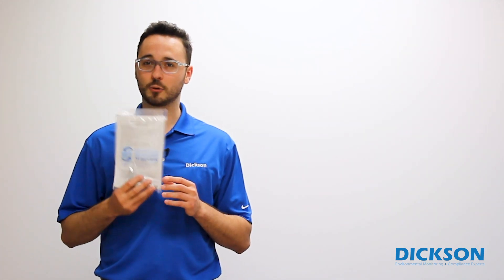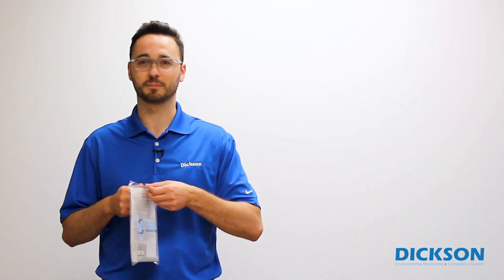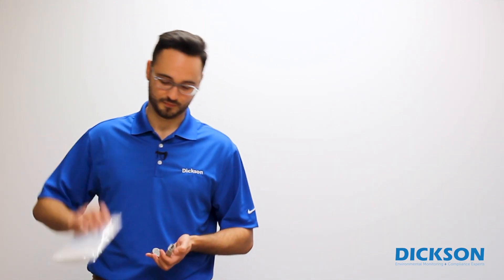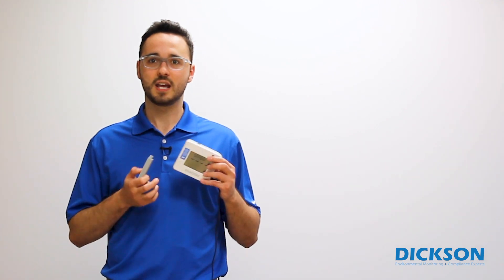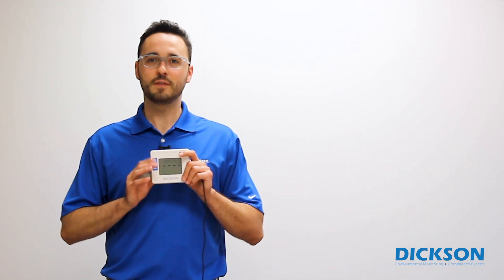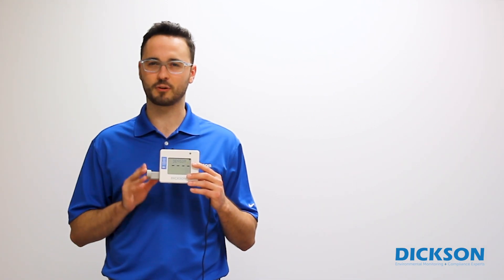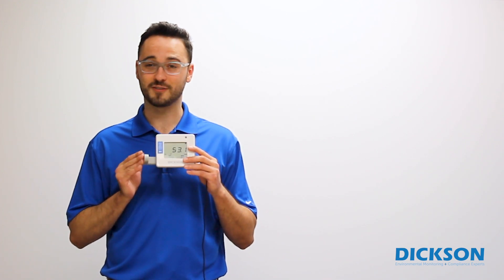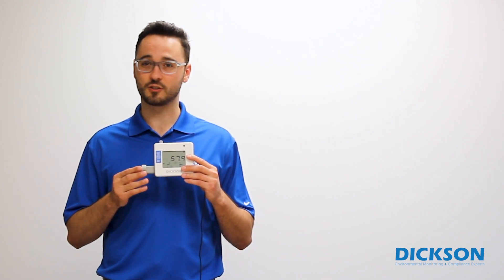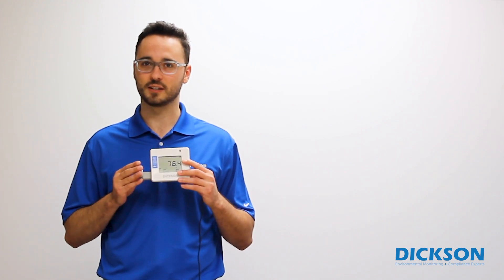If you purchased a NIST or A2LA calibration, your certificate will be in this bag along with the sensor. Once the old sensor is removed, plug in the new sensor into the device. We've designed the sensor and extension in a way that allows you to plug them in one way to ensure the proper connection each time. Make sure the sensor is pushed all the way into your device. You'll know your sensor is inserted properly when the word 'sensor' clears from the screen and your readings reappear.